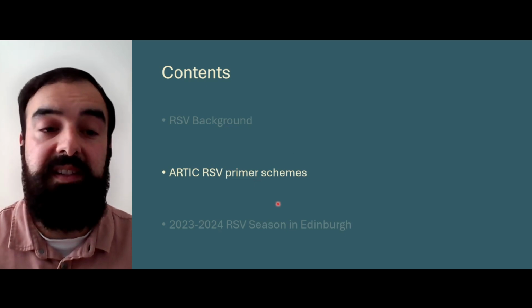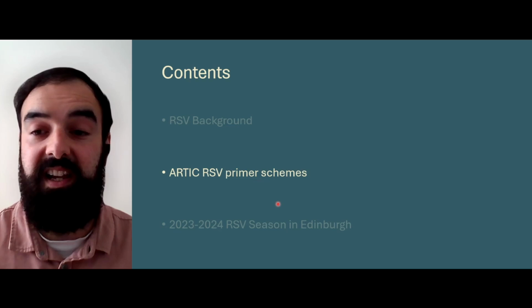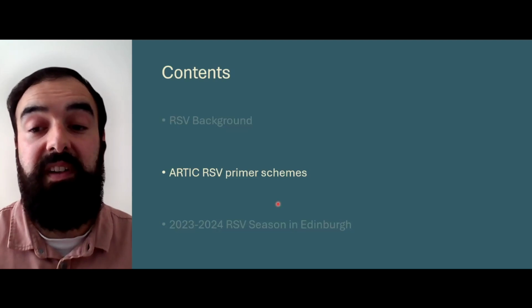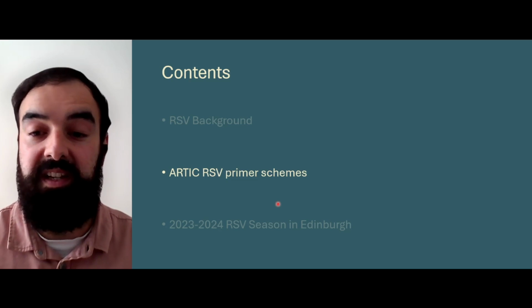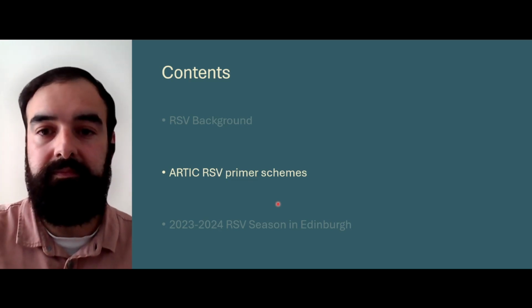Part of the reason for this, we believed, was due to the existing methods at the time being somewhat labor intensive. The commonly used approach used 4 PCR fragments in 4 separate reactions, which has been very effective in getting whole genomes, but each of these 4 fragments needed to be independently quantified and pooled before sequencing could begin, which takes considerable time and effort in labs.